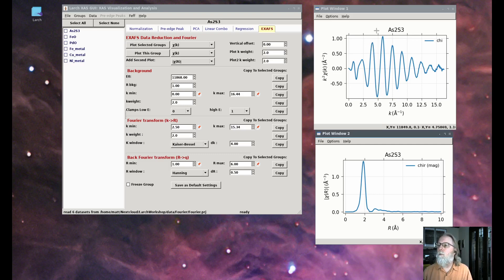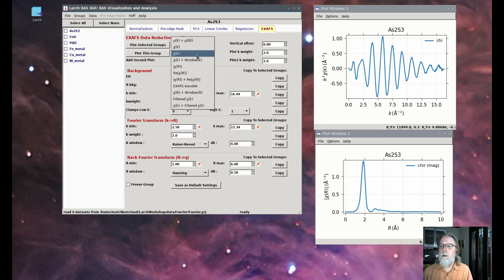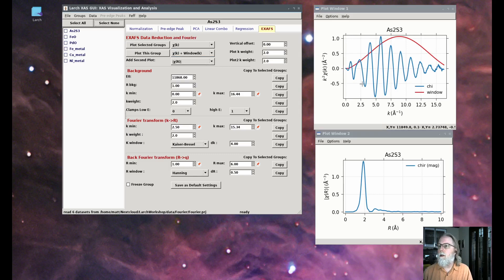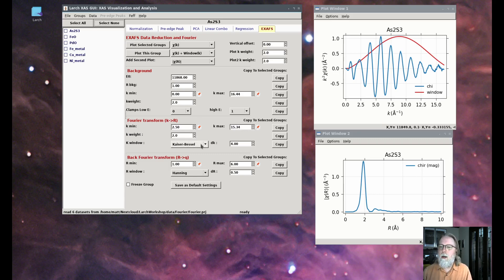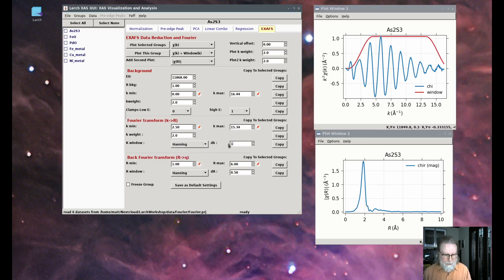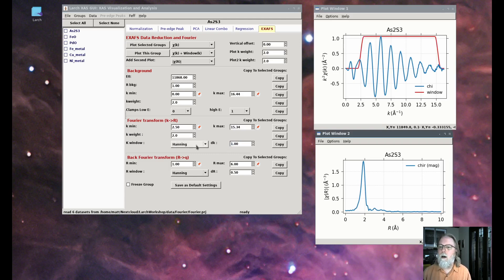To make that Fourier transform, we first multiplied by a windowing function. In order to help lower some of the artifacts that can arise in the Fourier transform, we first multiplied by this smooth function. A simpler window might look like this — in older days, this was a common approach: a window function that starts at zero and then multiplies by one over most of the range. Here we're going from 2.5 to 15 inverse angstroms, with a DK of one inverse angstrom, meaning it ramps up from zero to one over one angstrom centered at 2.5, and similarly ramps down to zero around k=15.